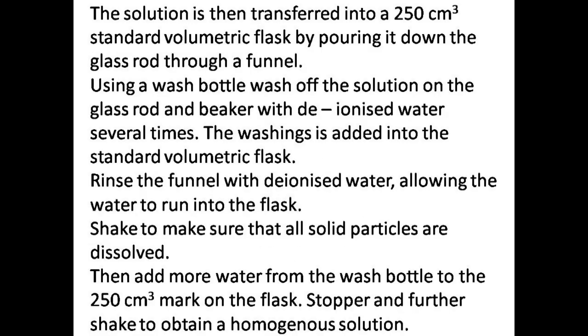The solution is then transferred into a 250 cm³ volumetric standard flask by pouring it down the glass rod into a funnel. Using a wash bottle, wash off the solution on the glass rod and the beaker with deionized water several times. The washing is added into the volumetric flask. Rinse the funnel with deionized water, allowing the water to run into the flask. Shake to make sure that all solid particles are dissolved.